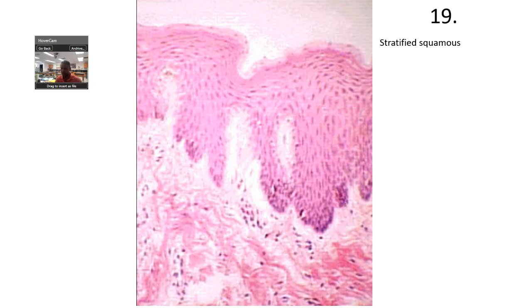Now look at this — see the flat cell, but underneath it is not another flat cell; it's circular. This is the lumen, and this is connective tissue. That makes this transitional stretched. Earlier I showed you transitional unstretched. Notice this flat cell — this would be like a dome cell. So this is transitional epithelia.